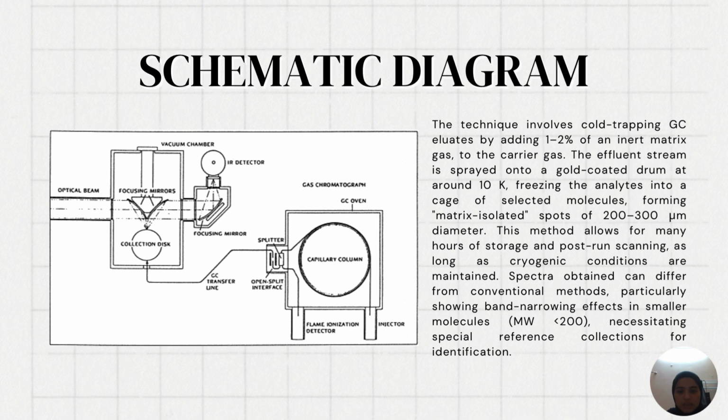Spectra obtained can differ from conventional methods, particularly showing band narrowing effect in the smaller molecule, necessitating special reference collection for identification.